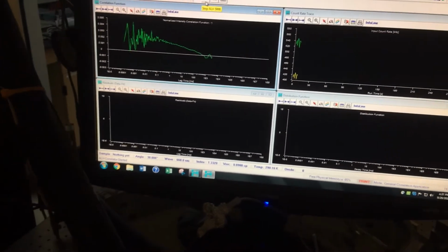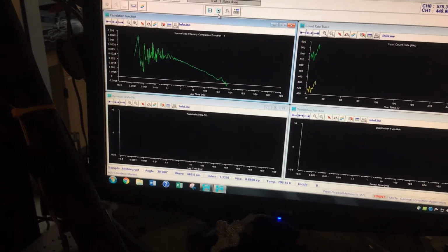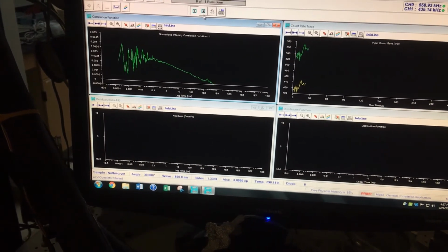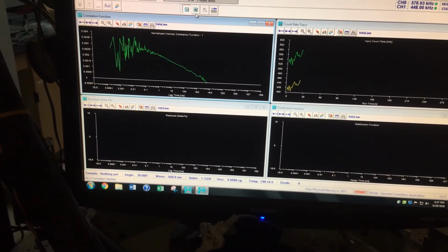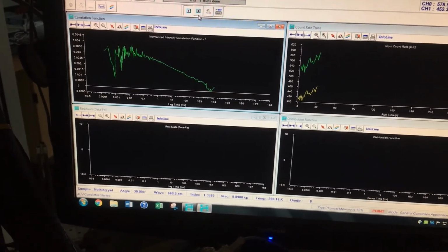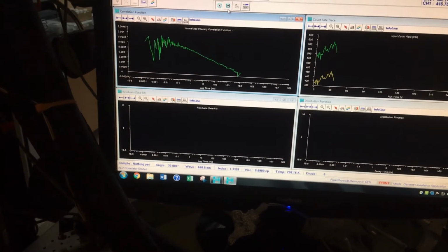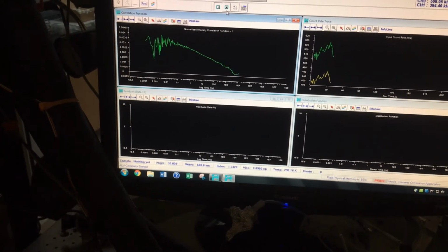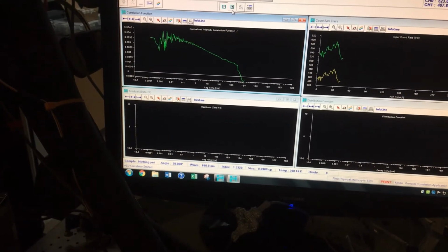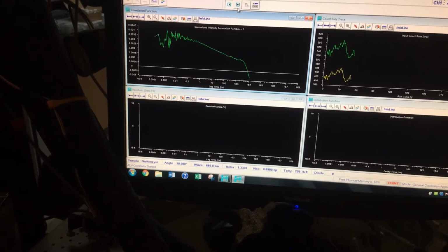And you'll see that it's noisy at the beginning. That's due to photon starvation. There just aren't that many photons per measurement sample at the early times. And then at the end, it's kind of noisy and bumpy because the system is still settling in. And for that lag time there of 10,000 milliseconds, 1E4 is about where it is now. So that's making comparisons of 10 seconds. To really get the response of the system at those times, you would need exceedingly long acquisition times.